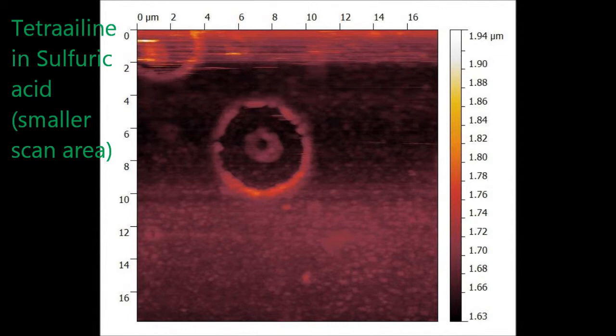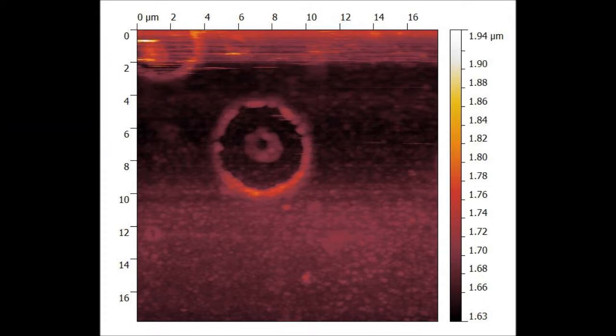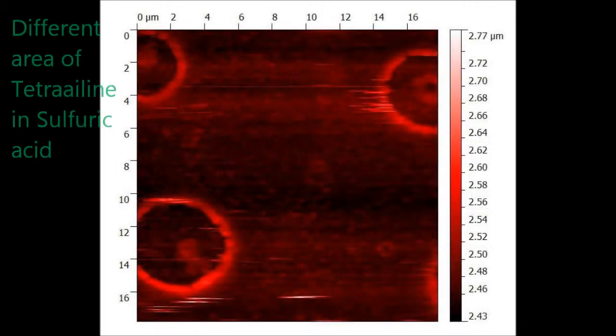The benefits of an atomic force microscope are that the sample does not have to go through rigorous preparation before being observed, and that the tests do not need to be carried out in a vacuum, unlike electron microscopes. Also, the fact that AFMs can build up 3D images is hugely beneficial. Unfortunately, AFMs are currently limited in the size of the sample they can scan.